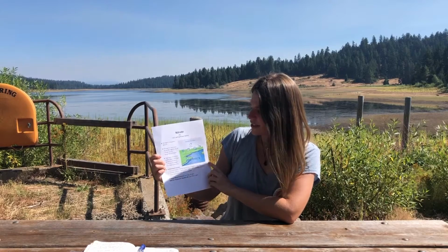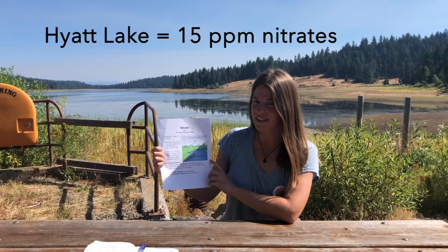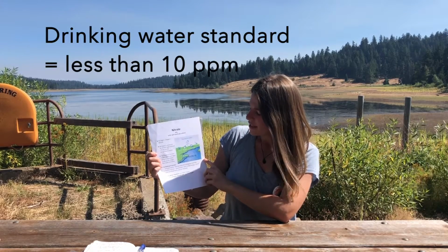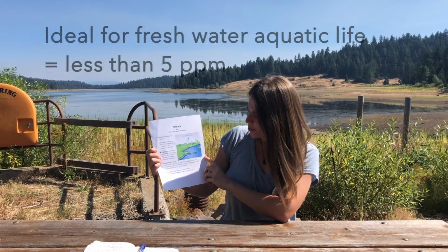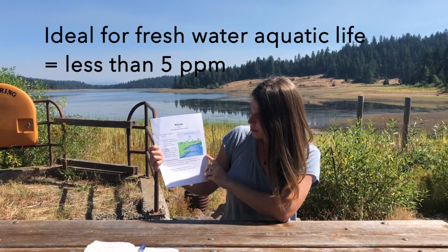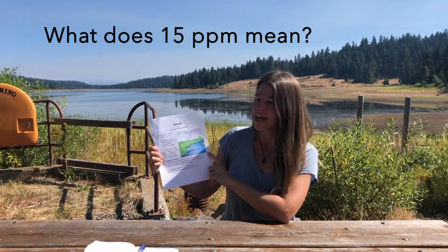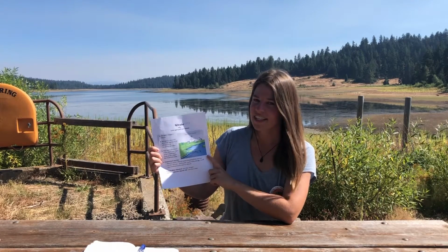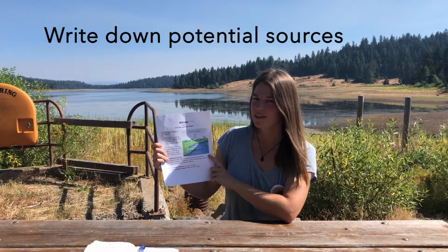So what do our results tell us? We got 15 parts per million of nitrates. The drinking water standard is less than 10 parts per million, and ideal for freshwater aquatic life is 5 parts per million or less. So what does 15 parts per million mean? Now go to your data sheet and write down where you think the nitrates came from in Hyatt Lake and what those results mean.